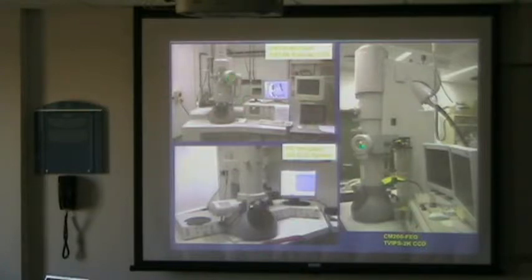We have the stage, in this case here. That's where you put the sample in a little hole, and what you observe is on a little rod. In this case, the stage is only this little bit. And then we have here the aperture, the condenser area up here, the objective area here, and the projector down here. And then in this chamber here, we can observe our images.